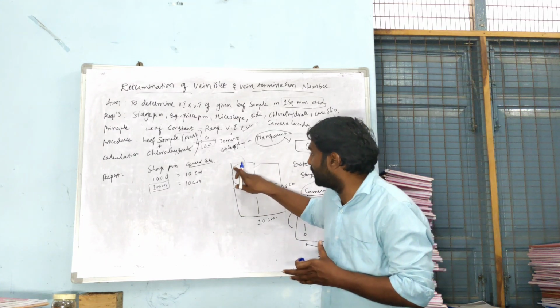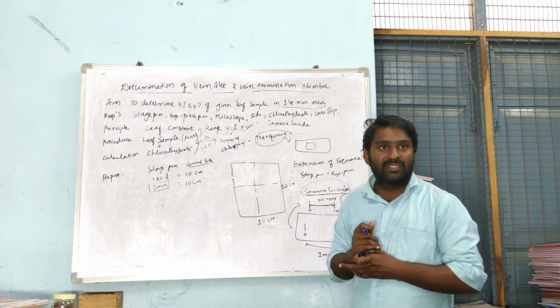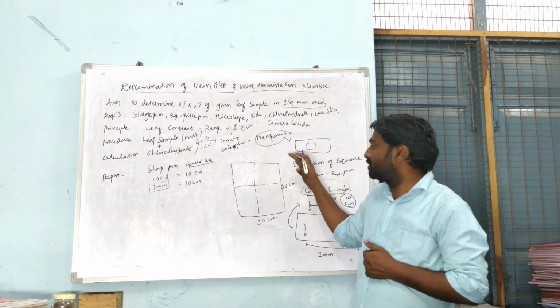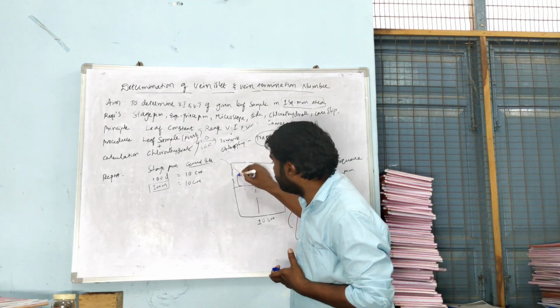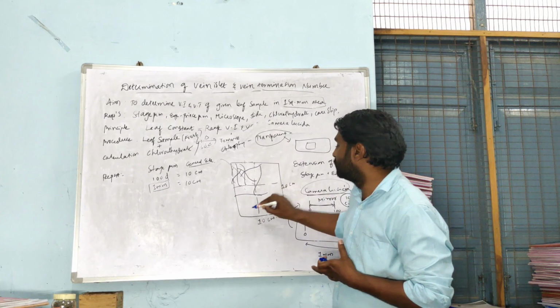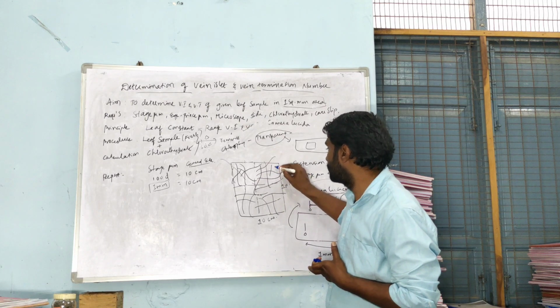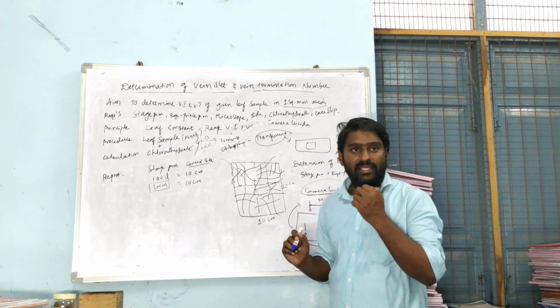While drawing or tracing, you should see that the images, whichever they are, traced as vein islets and vein terminations, without disturbing the microscope, without disturbing the image, you are supposed to continue throughout the process until your complete square is filled. Once you draw, you could see that there are a number of vein islets and vein terminations spread throughout the squares. So in this manner we may get it. This would be a sample.